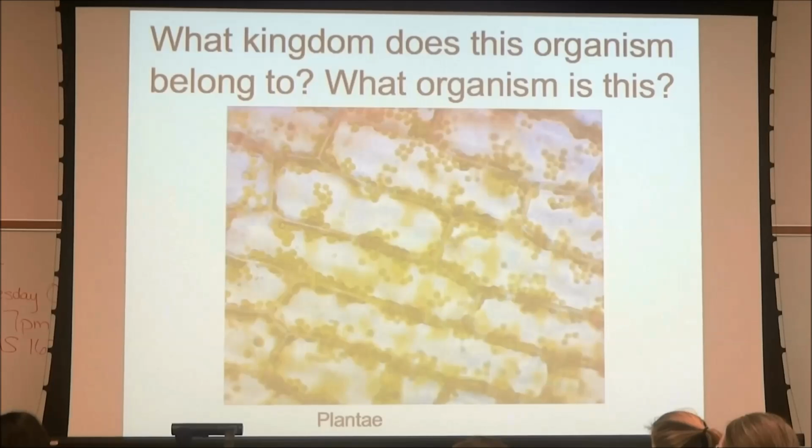Yes. So how did you know it was a plant cell? Because of the shape. It's rectangle, right? The chloroplasts. Very good. It's rectangular and you have chloroplasts. Okay, so it is the Elodea. You guys can take your photos. All right, it is the Elodea leaf.